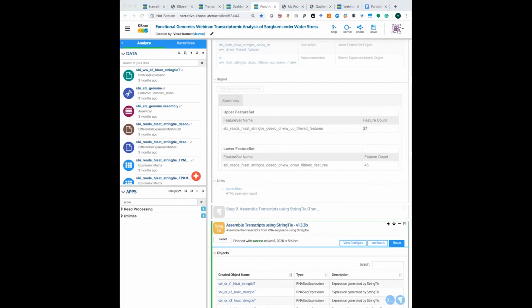The reason I want to run through some of that is, if some of you are interested in exploring the results further outside KBase, you have this detailed analysis generated by the tools, and we capture that analysis as well. In addition to providing you these visual insights and detailed reports, I have already downloaded the results to my local desktop, and I'll quickly run through those and provide some additional insight into the output of those apps.